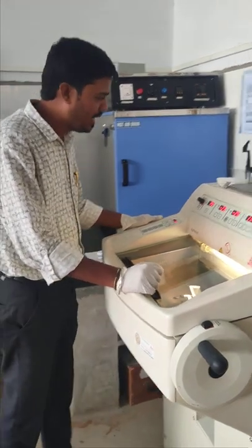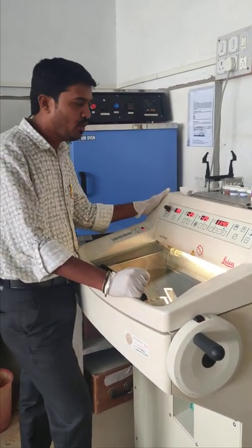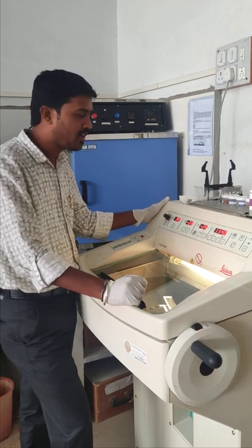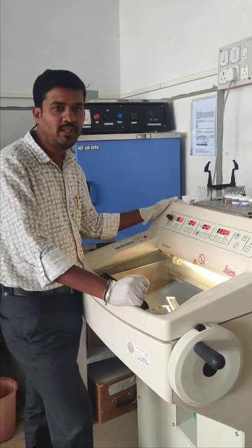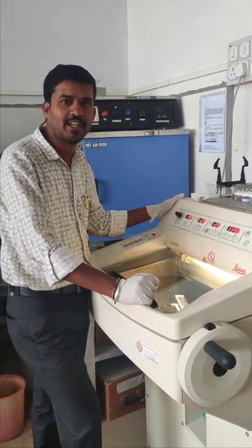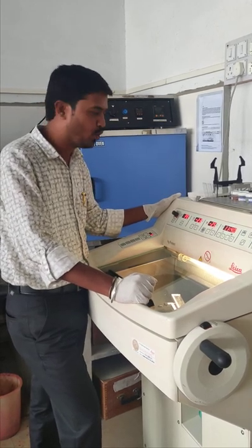Hi everyone. Today I'm going to explain about frozen section bar cryostat. We call this instrument a cryostat, also known as a cold microtome.